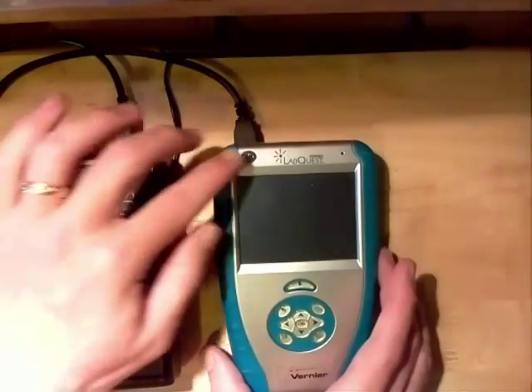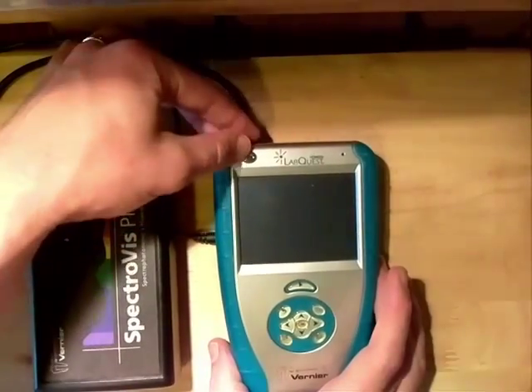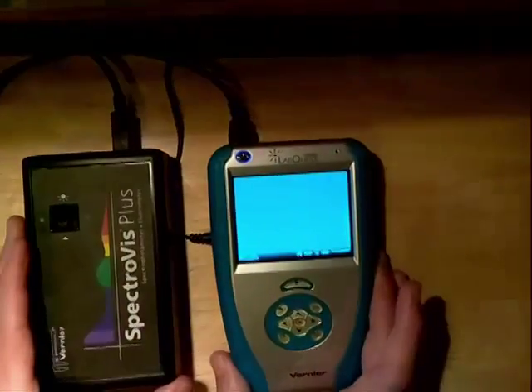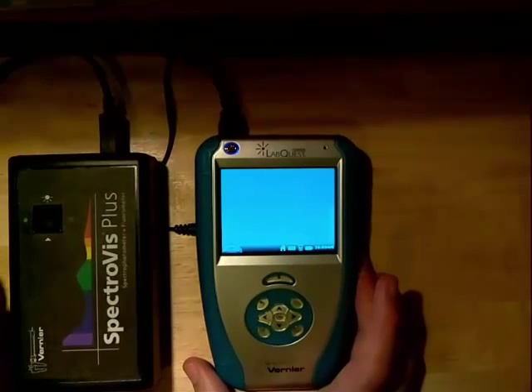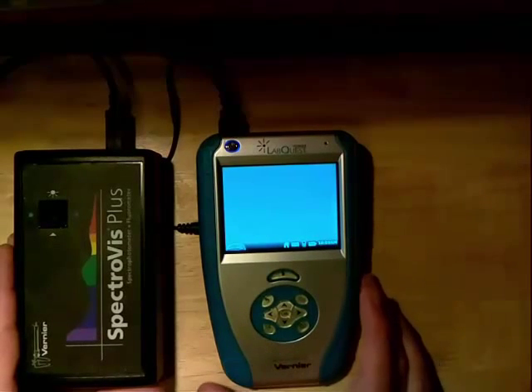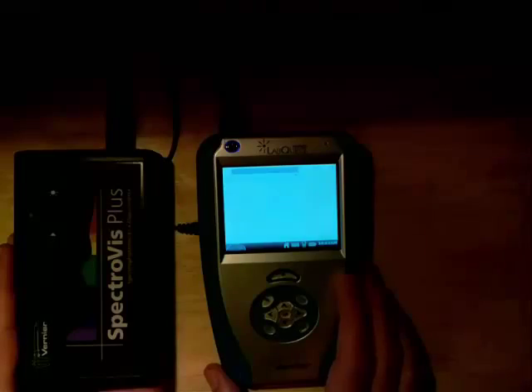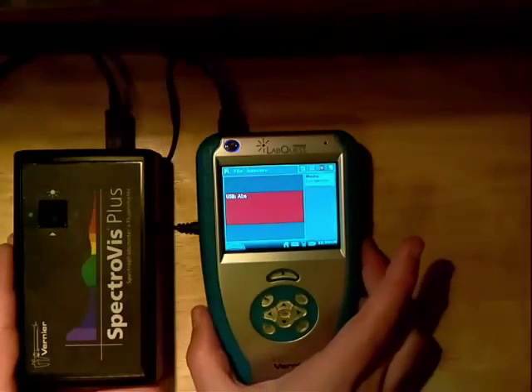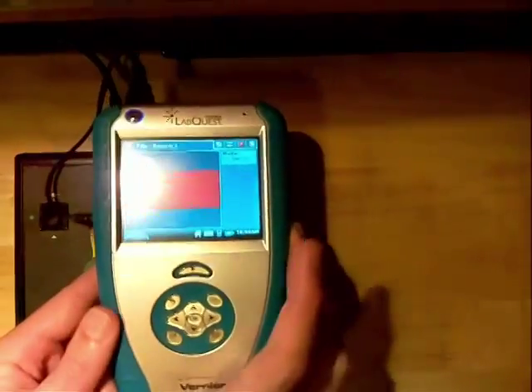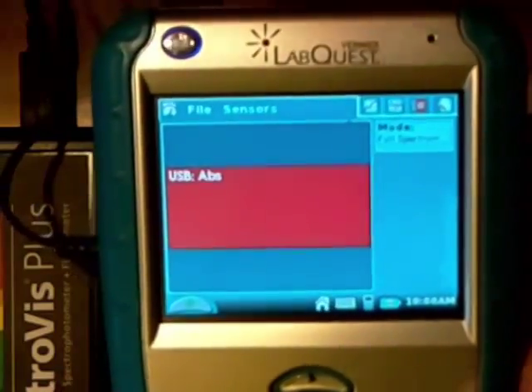First thing we'll do is press the button to turn it on. If everything is connected already, we'll see that the LabQuest will detect the Spectravis — and up it comes. Notice how it is showing us absorbance, so it knows that a spectrophotometer is connected.